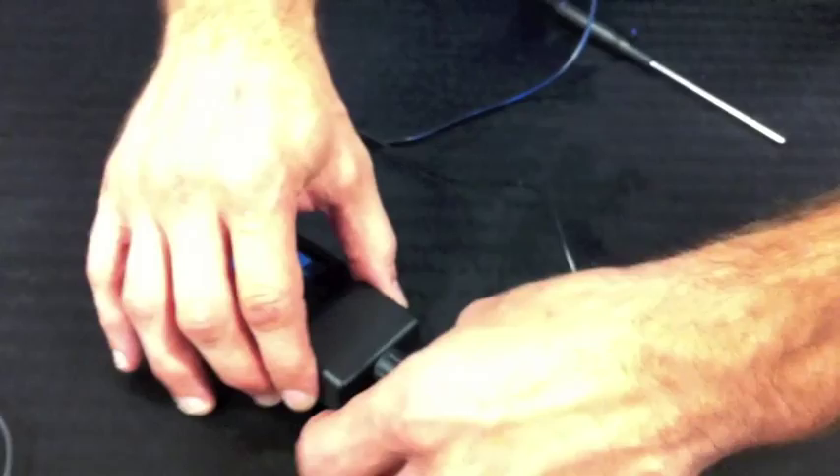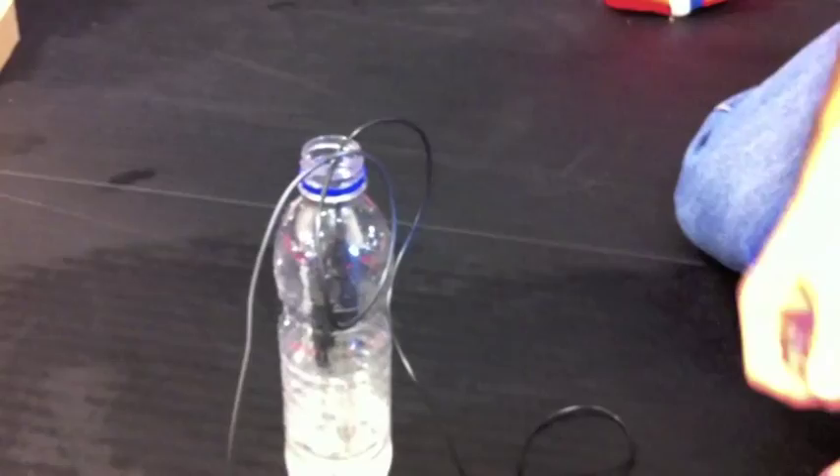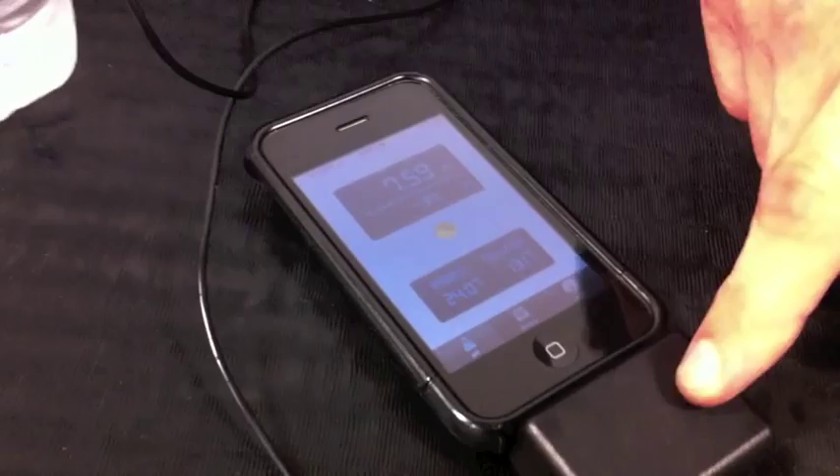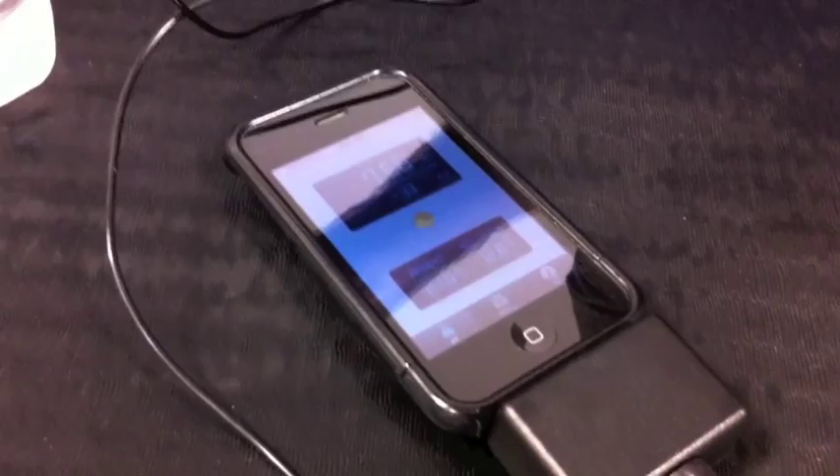So I'll plug in the temperature sensor and drop that into my water here. And now I'm getting a reading of the temperature of the solution that I'm measuring. The other display is the ambient temperature from a sensor that's inside this. People who don't have a temperature probe can use the ambient temperature for calibration, or they can enter in a standard temperature.